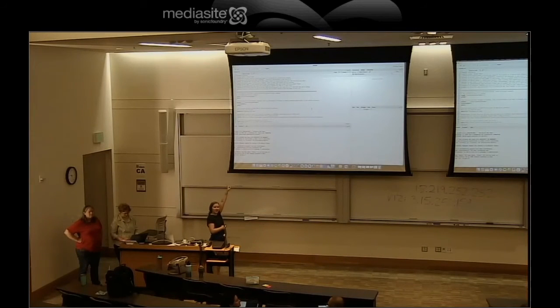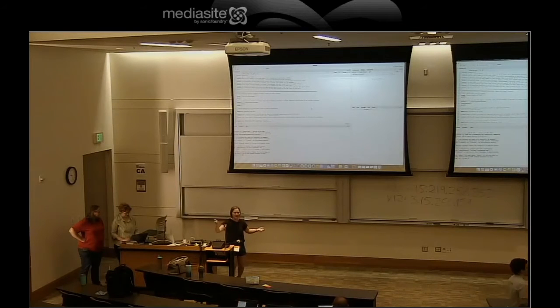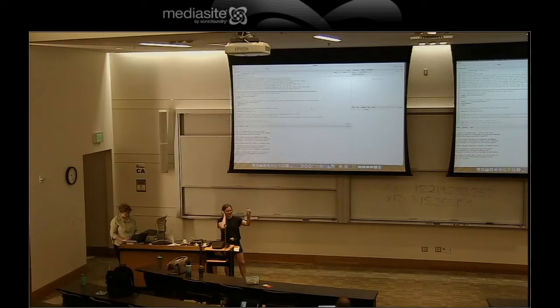When you have a pound sign, a hashtag, in the front, it means your code won't run. That's called commenting your code. Commenting is a really good idea for things you want to make a note of. Here, something weird happened. Hashtag weird thing, right? Keeping a script is almost like keeping a little lab notebook for what you're actually running on your data. And these comments are really useful for keeping track of things you notice while you're doing your data processing.